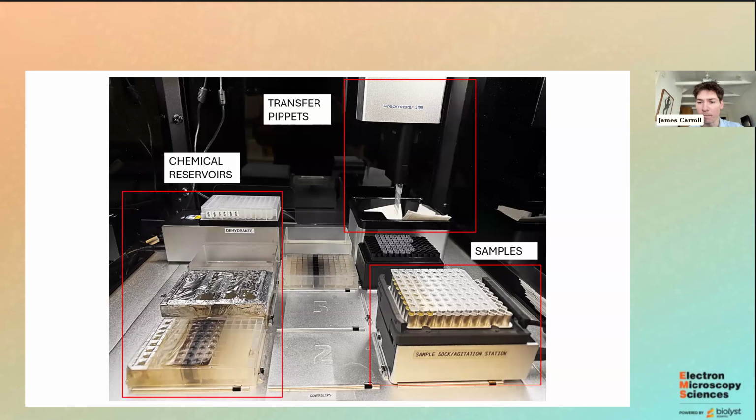Okay, great. There was a comment about the osmium neutralization. Ria was saying that they used to use corn oil, but now they use milk powder and water, which neutralizes osmium. Yeah, I've heard that too, and I've brought it to the attention of our chemical waste people, but they want us to continue using the corn oil. They're the ones that pick it up and dispose of it, so I'll do what they want to do.